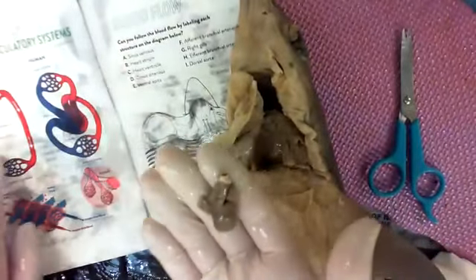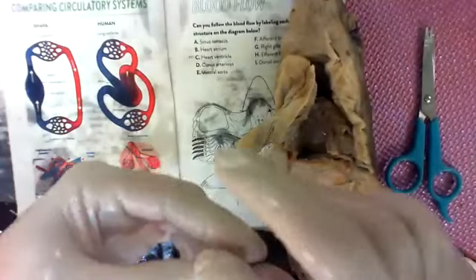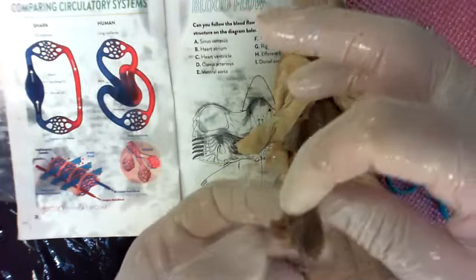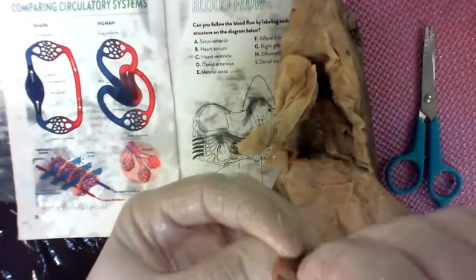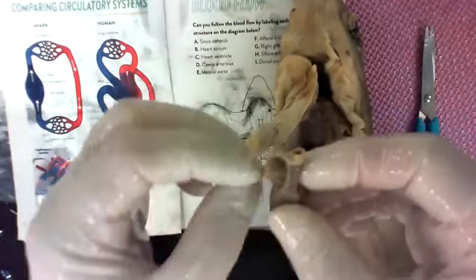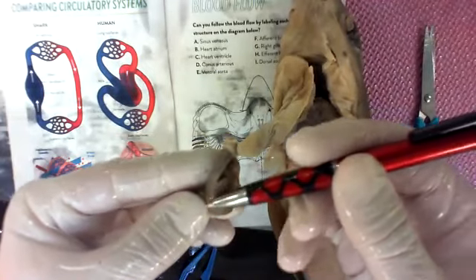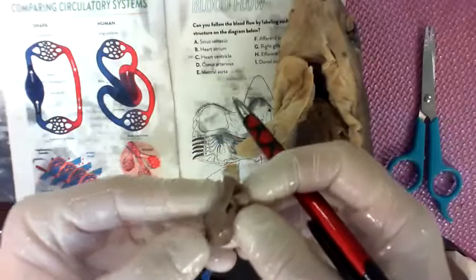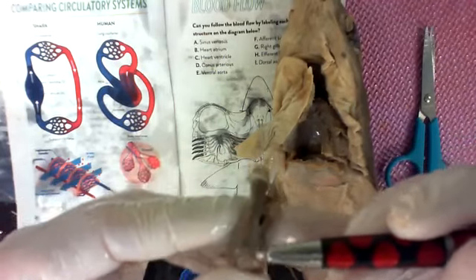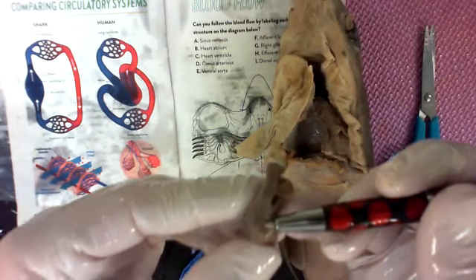Shark heart. So in the picture, it shows it going straight through the heart. Not so much. So blood comes up here and this, oops, sorry, into this venous sinus. It goes into the atria, which is this flappy sac. It's all flappy because the atria is small and thin. Then it goes from the atria back here down and into the ventricle, which is this massive, kind of harder, more firm area. I can actually see all the little tiny blood vessels going to the surface of the heart, keeping the heart alive. These are called the coronary arteries. If these get broken or blocked with clots, that's when a heart attack happens.